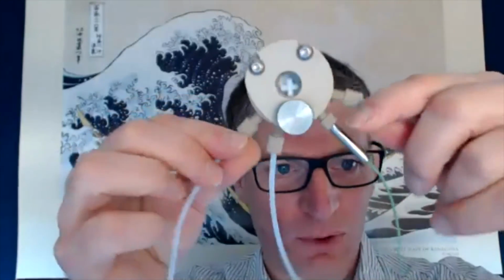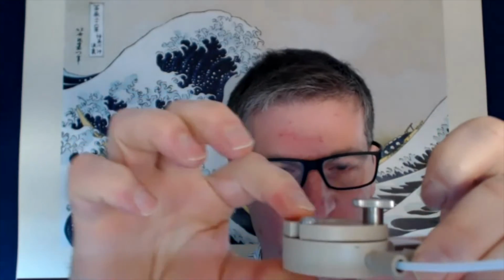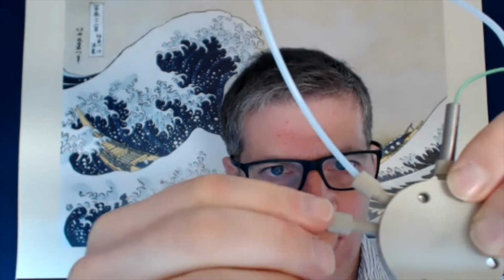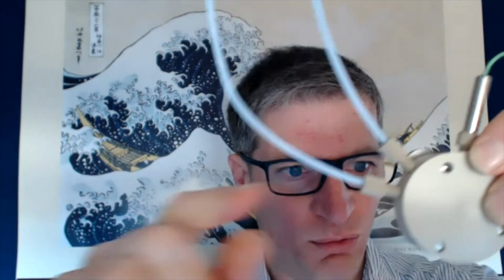Have you ever experienced leakages in the system? Now it's being pressure tested, so I would say no. I mean, look, any system like this has got four pipes on. The lid actually is really good. We find that thumb tightness is really good, and I don't think we ever see leakages there. You've got to make sure your O-ring material is compatible with your solvents. And these are standard HPLC, the low pressure version of HPLC fittings. And actually, a finger tight nip on these is really robust.